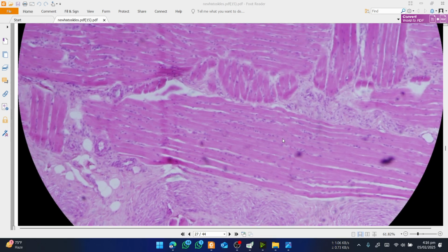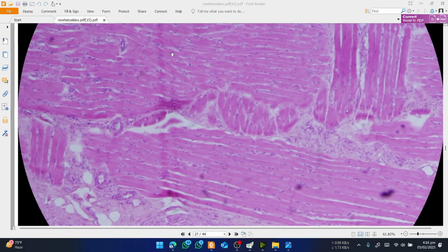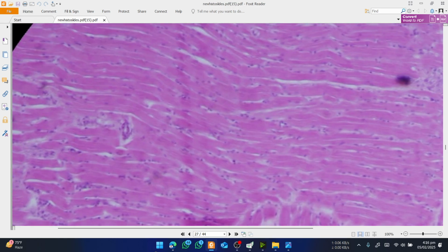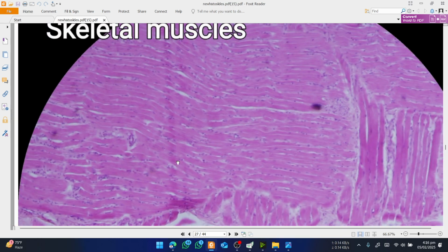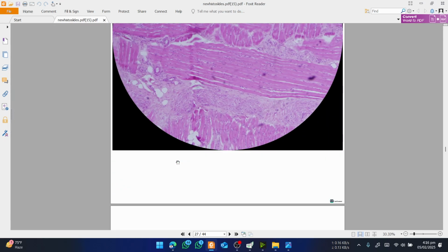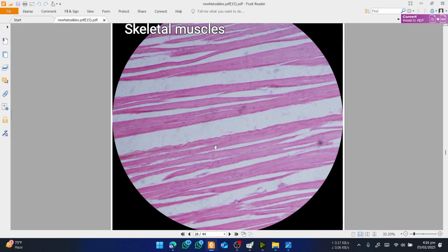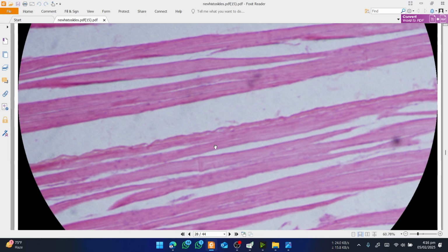Ideally, you should see striations, but those are visible only in very nicely made tissue slides, which is not always the case, not in this picture at least. So, skeletal muscle again, the fibers are separated. Again you can appreciate the nucleus running along the peripheral wall.